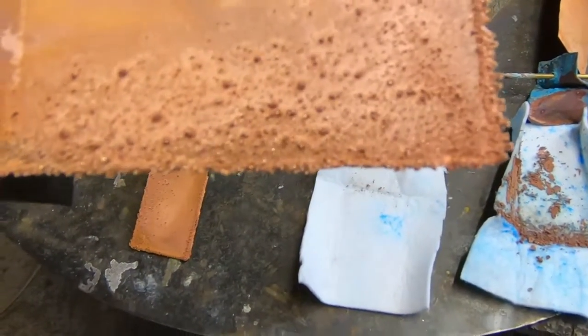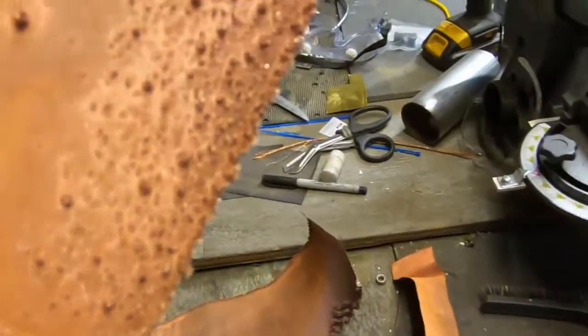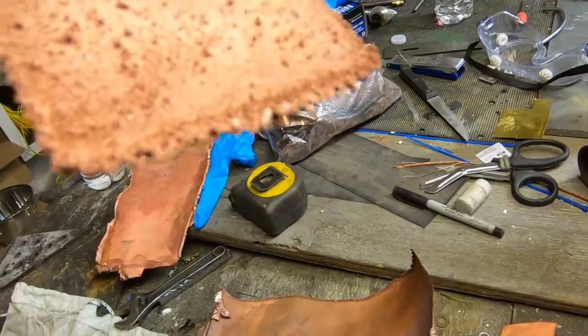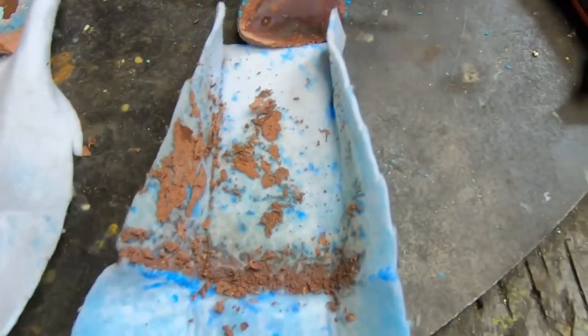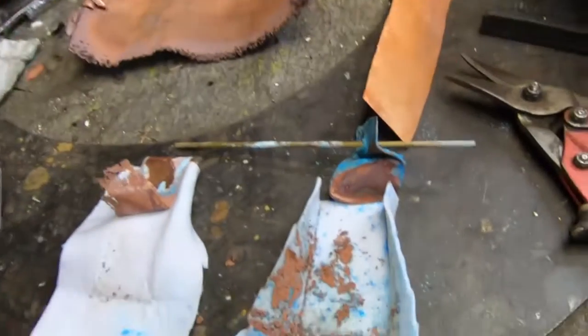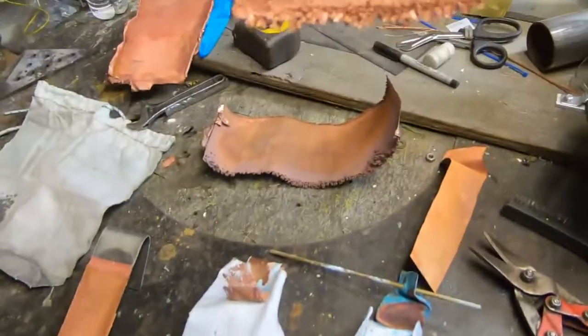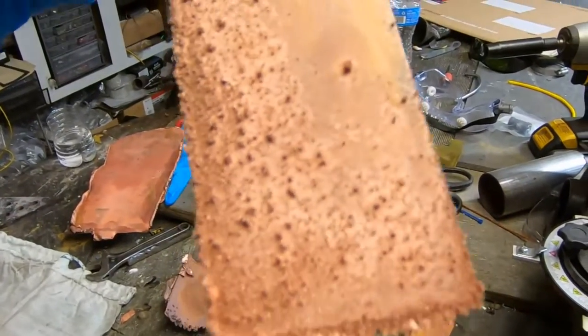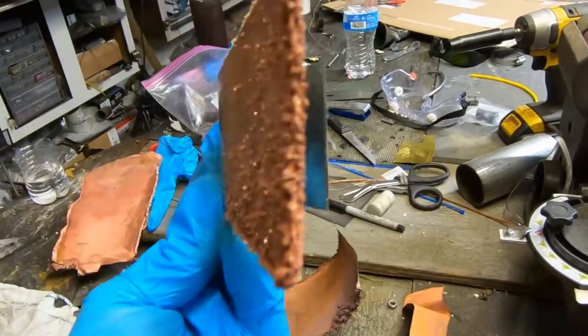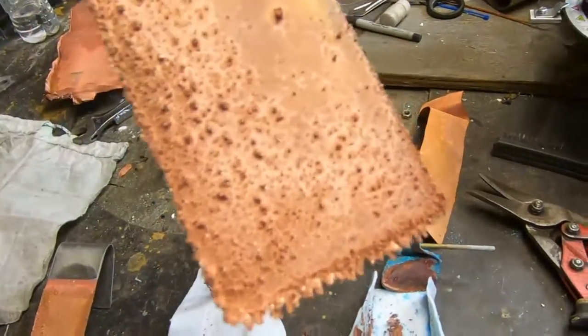So this should be one step more pure than that article there. And there is a lot of glittering in here. And a lot of this inconsistency came from the fact that our anode had dissolved on us. So I ran the test a little bit too long, basically, and it caused inconsistencies in the morphology of the anode, which have reflected. And I think what happens is you start pulling so much copper out of solution. That's another cause for these crystal formations, I believe.